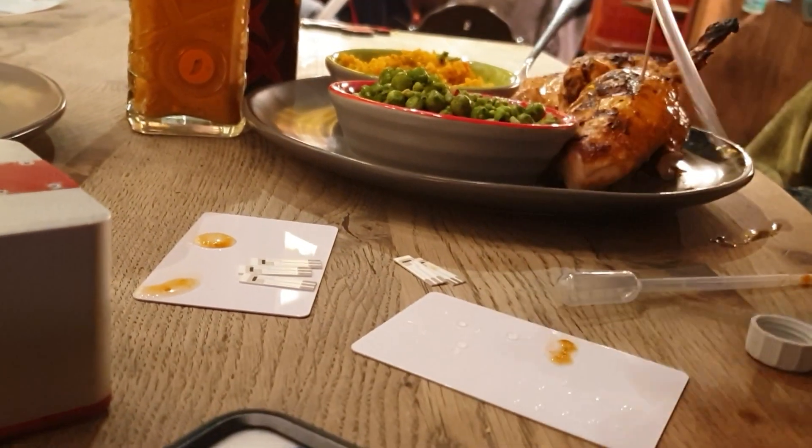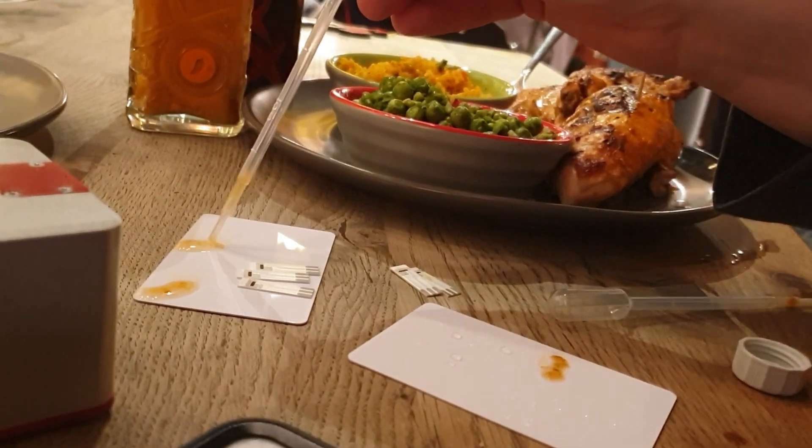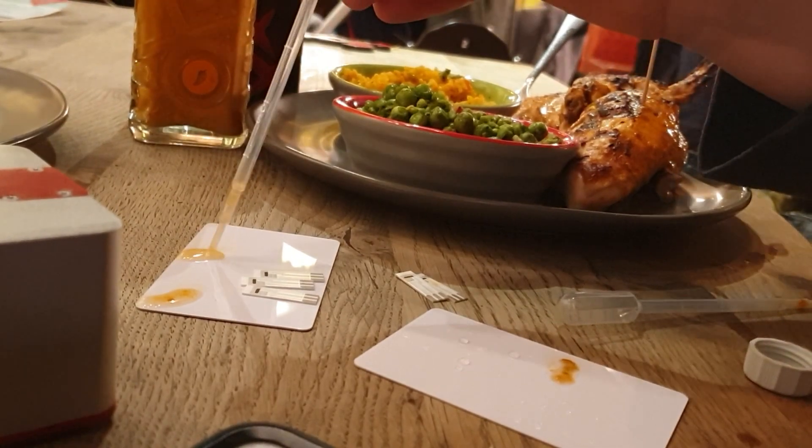So I've got it diluted. I'll mix this for about ten seconds: one, two, three, four, five, six, seven, eight, nine, ten.